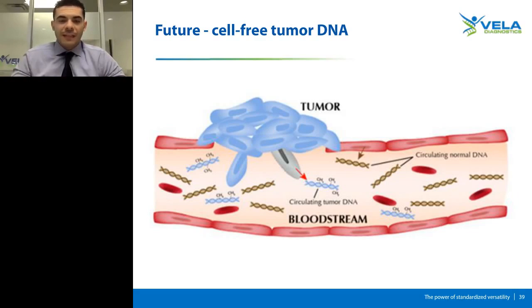So what we end up having to apply is sort of a whole genome shotgun sequencing approach to a relatively small genome. You might have regions that are about 1,000 base pairs long, but you have to apply this whole genome approach to the viral genome in order for you to actually be able to get robust and efficient sequencing data out of it.